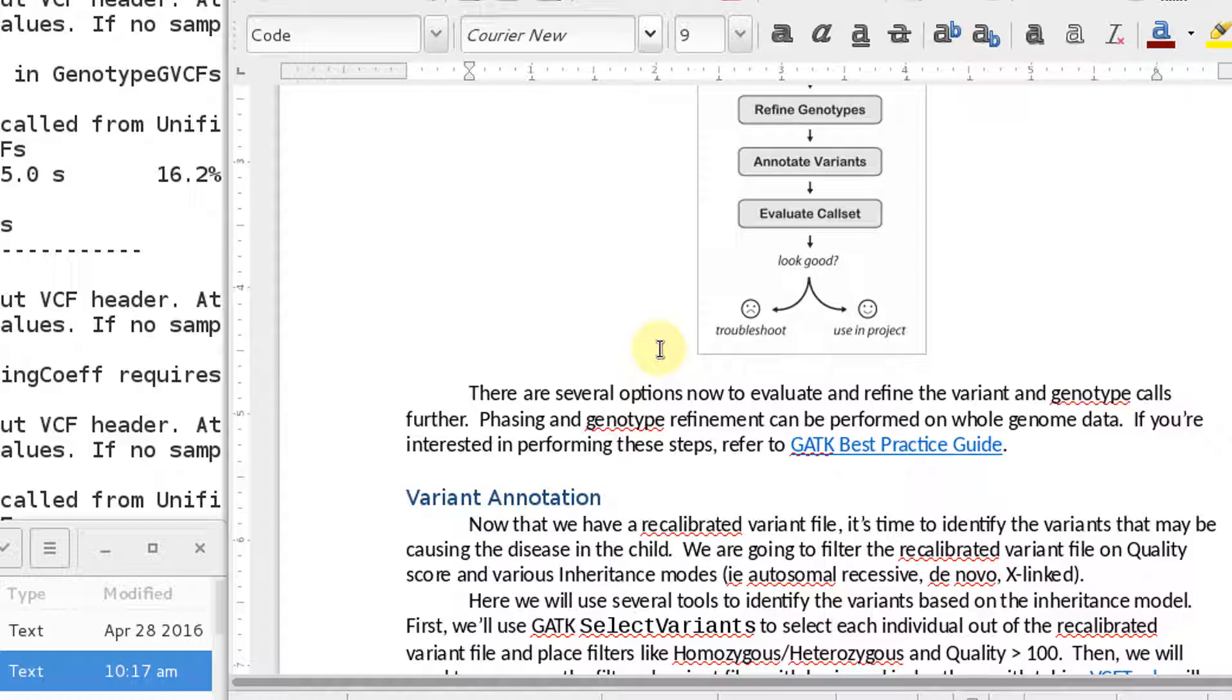There is no information whatsoever of what gene did it fall under, what type of mutation, was it missense, was it a frame shift, did you introduce a stop? None of that information is provided in these VCF files that were generated from the GATK pipeline. So you really need to come in and annotate your variants.